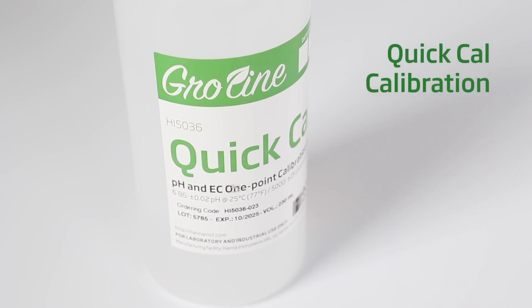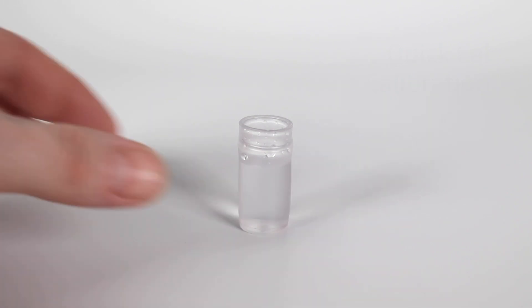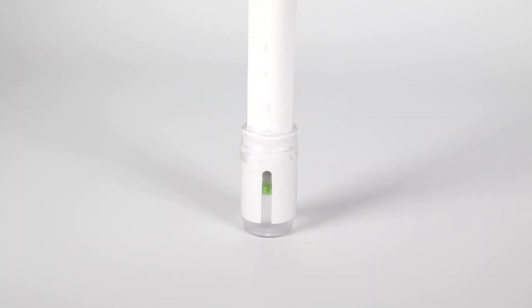Calibrating your HI-9814 growline meter in quick cal mode is simple. The meter comes out of the box set to quick cal mode. If this is the first time calibrating your meter, it is best to add enough storage solution to the cap so that it covers the glass bulb completely and wait at least one hour to hydrate the sensing glass.